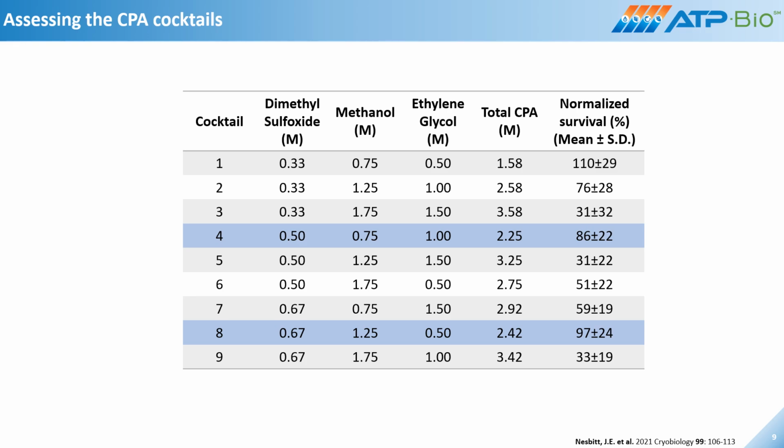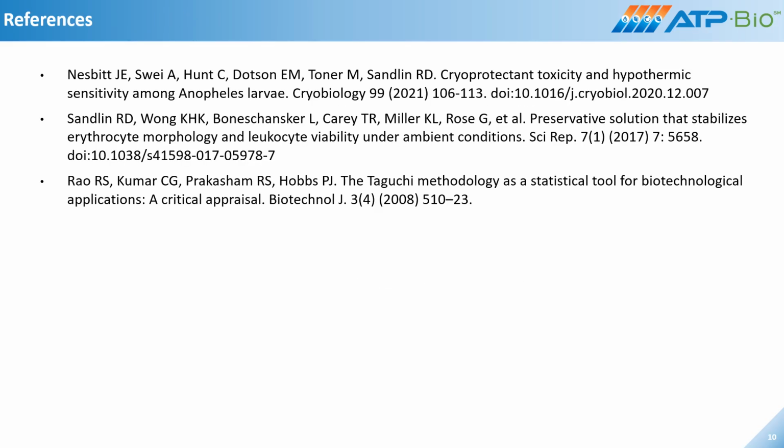So this completes the Taguchi method of design for CPA cocktails for use in cryopreservation of mosquito larvae. The Taguchi method has also been used for biostabilization of blood and developing CPA cocktails for zebrafish larvae.